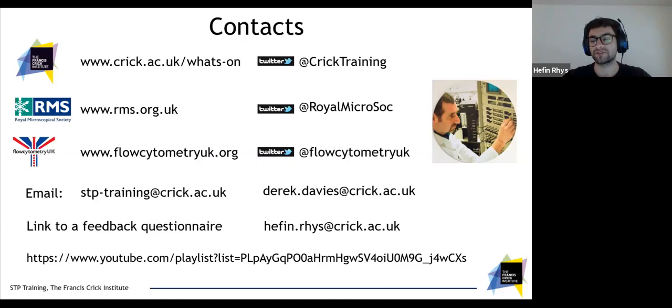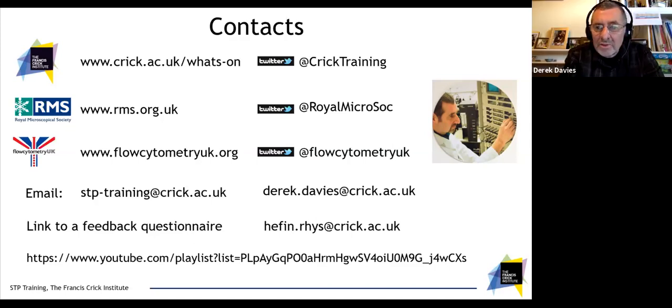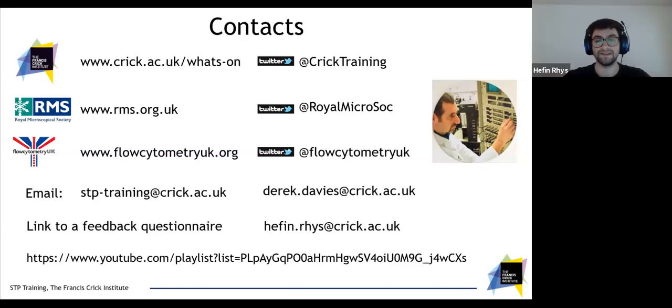One other thing with the ImageStream is that the cross beam spillover tends to be higher than on most modern conventionals. What I mean by that is, for example, it's quite normal to see a bright DAPI stain spreading over into your FITC or your GFP channel. I suppose it would look different anyway because you're not using the same filter sets on the ImageStream as you are on a cytometer. Yes, in most cases, absolutely.